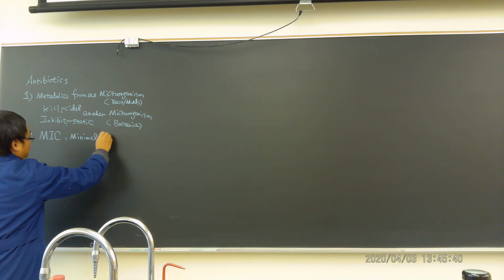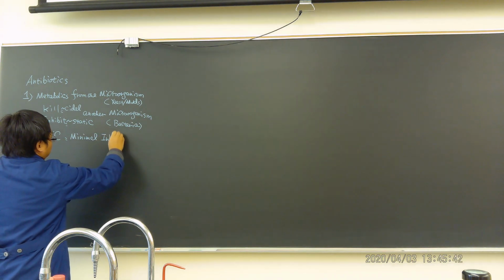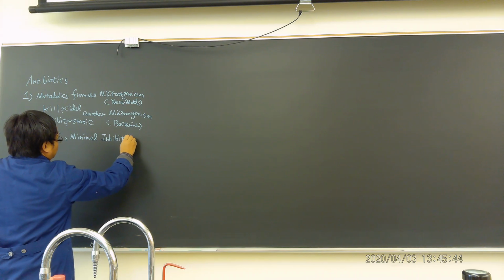So we just review. Second, how do we test antibiotic resistance? What we really want to test is the MIC, the minimal inhibitory concentration.